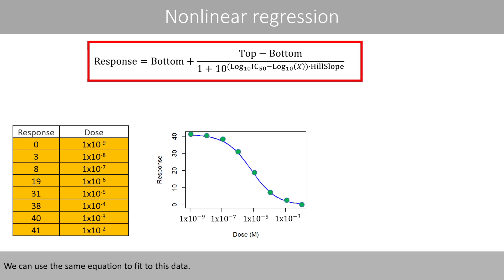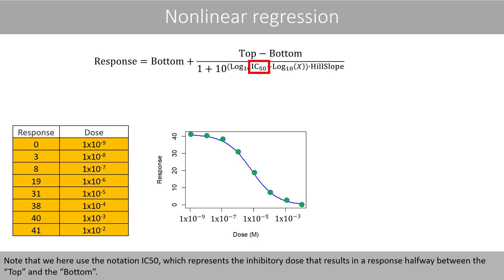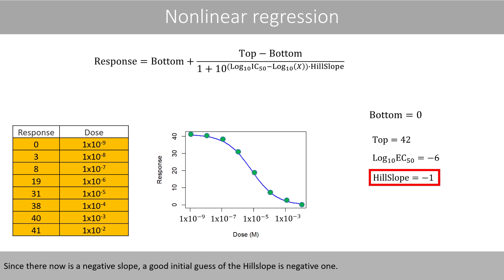We can use the same equation to fit to this data. Note that we here use the notation IC50, which represents the inhibitory dose that results in the response halfway between the top and the bottom. Since there now is a negative slope, a good initial guess of the hill slope is negative one.